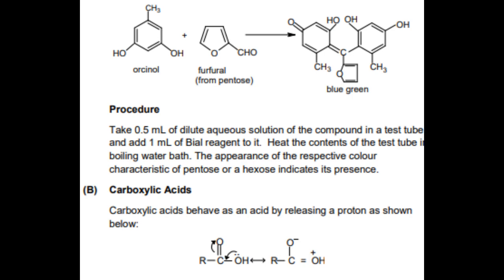1. Sodium bicarbonate test. Carboxylic acids react with sodium bicarbonate solution and brisk effervescence of carbon dioxide evolves in this reaction, which is clearly visible. This reaction leads to the formation of the sodium salt of the carboxylic acid as shown below. RCOOH + NaHCO3 → RCOONa + H2O + CO2↑.